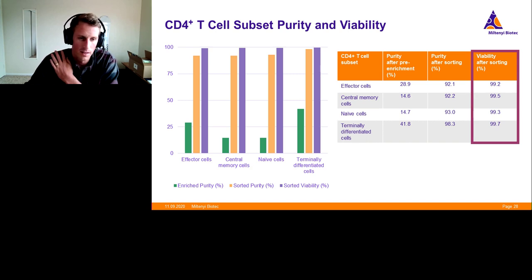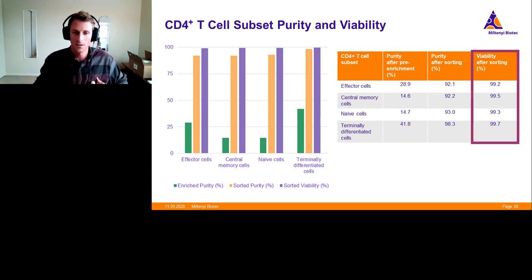We have a lot of research that's been done, that's being done on this. I'll go into a little bit more on really the breadth of this technology to sort of validate that, okay, yeah, it's contained, yeah, it's not generating aerosols, but is it really as good as working with a traditional sorter? Can I really implement this into my workflow?